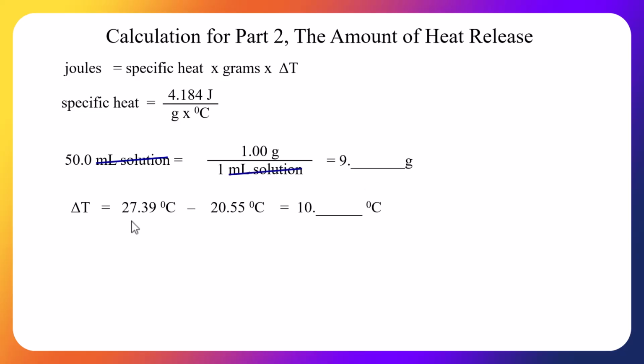Next, we're going to find out the temperature change. If I began at 20.55 and it raised to 27.39, I'll find out delta T. That will be the answer to question 10.